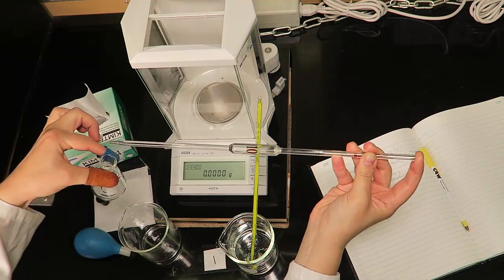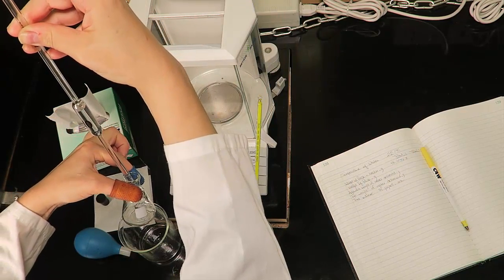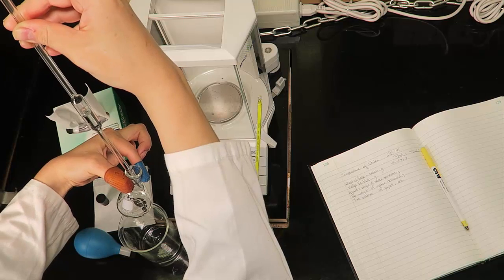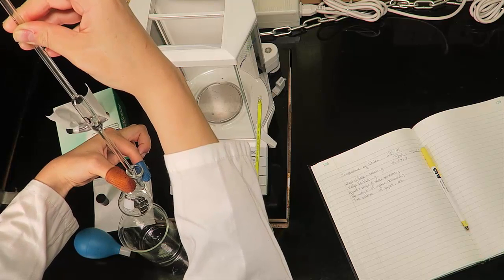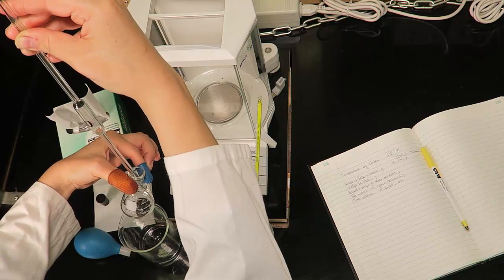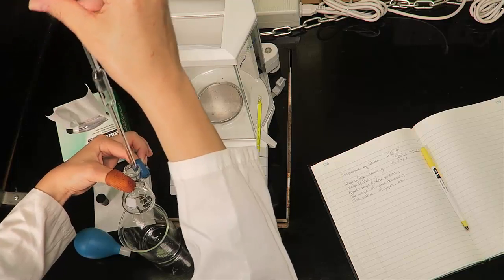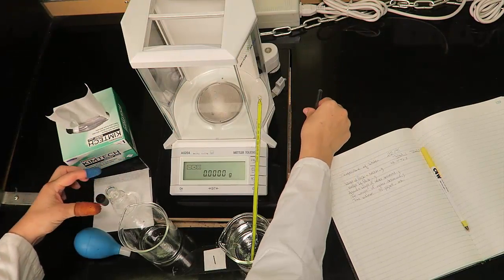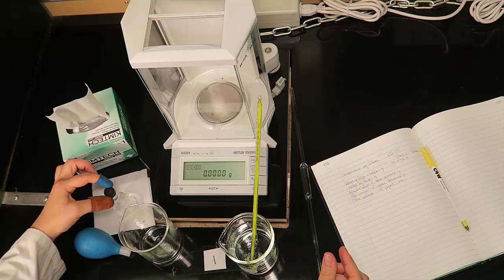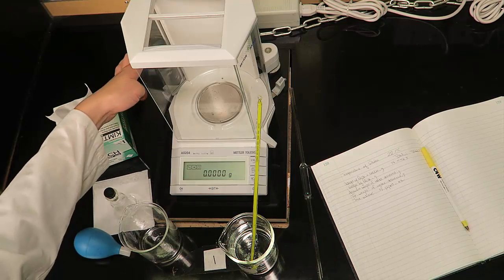Drain the pipette into the conical flask. Avoid wetting the neck of the flask where the stopper will sit. A wet stopper will give rise to evaporation losses during the transfer operation. Restopper the flask as soon as possible to prevent evaporation losses. Remember to never handle the flask or stopper with your bare fingers. Watch the aliquot video to learn how to properly use a pipette.